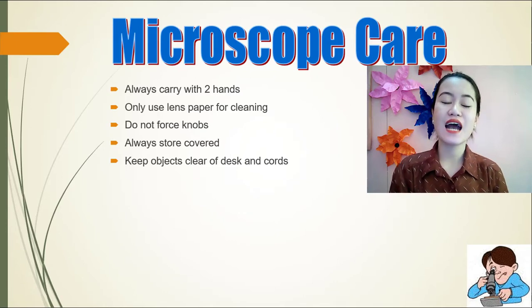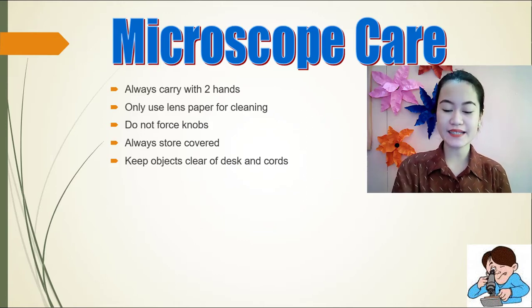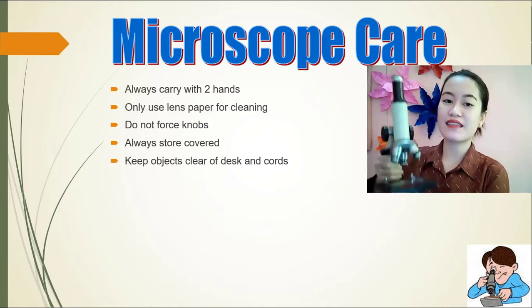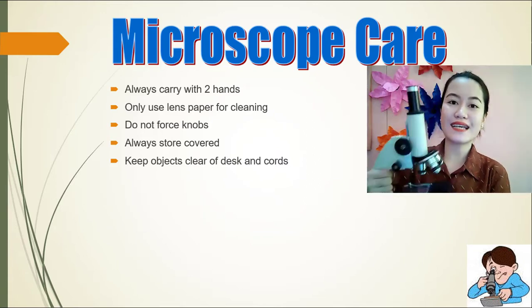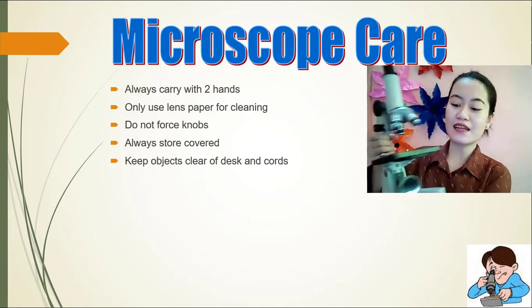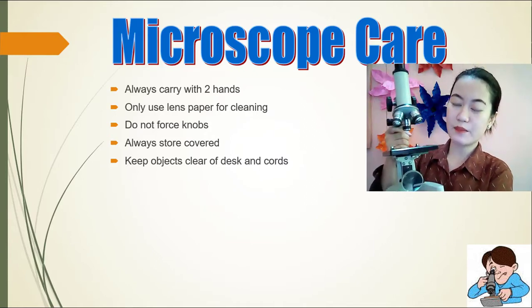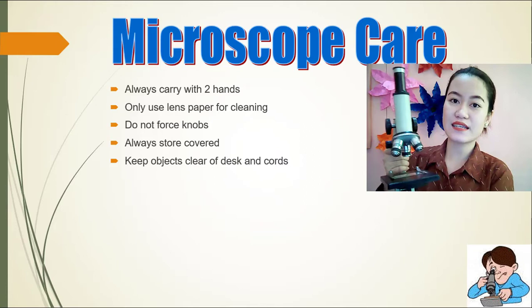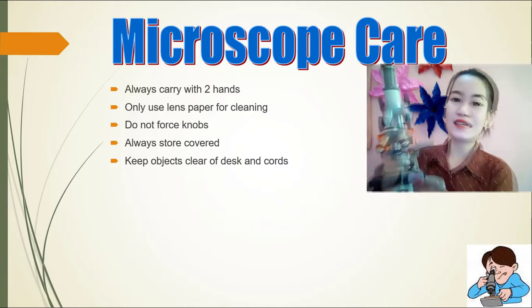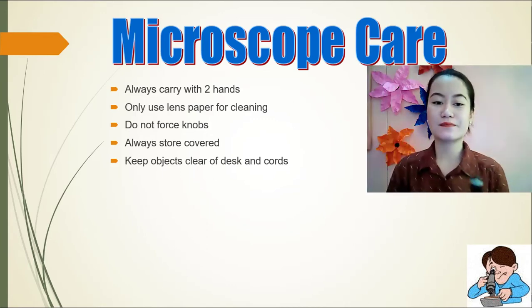Okay class, next, how are we going to handle our microscope properly? Number 1, always carry it with 2 hands. One hand is on the arm. Etong arm, kakapitan natin siya with our 1 hand. And number 2, we use our other hand on the base. Ikakapit natin yung ating isang kamay doon sa base. So this is the proper way to handle the microscope. So what's next class?